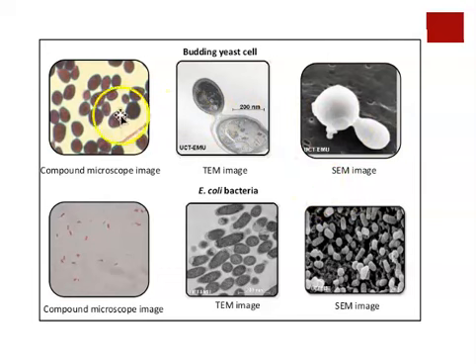What we're looking at across the top here, these are yeast cells. These are single-celled fungal organisms. And remember, by our definition, that is a microbe. Fungi can be single-celled or multi-celled. They can be microscopic or macroscopic. We just happen to be looking at a single-celled microscopic form, which is yeast.